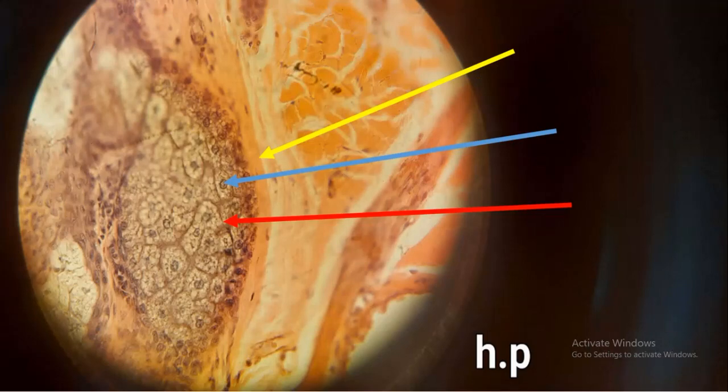This is a slide which has been viewed using the high power, okay? And we have used a light microscope. If you look at this whole part, this is the sebaceous gland. And this sebaceous gland, you need to understand, has prominent nuclei. These are the prominent nuclei, and each has a nucleolus inside. Around the nucleolus, you can also see the cytoplasm. And this is the cell membrane, okay?